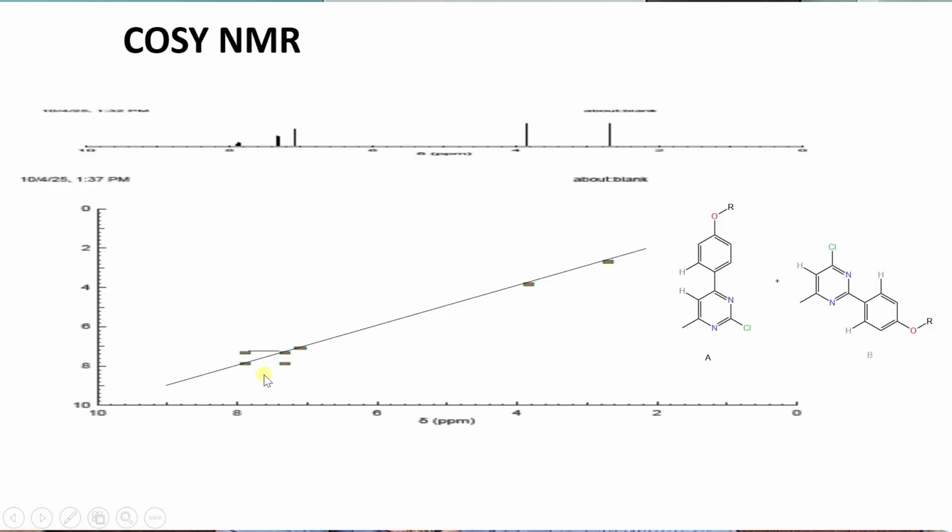Let's see. Now we see this proton which belongs to probably this region, these 2 protons, this is directly correlated with these 2 protons, means this one. It is clear from the structure also that these 2 are correlating, they are just adjacent to each other. Here also these 2 are adjacent to each other, fine.